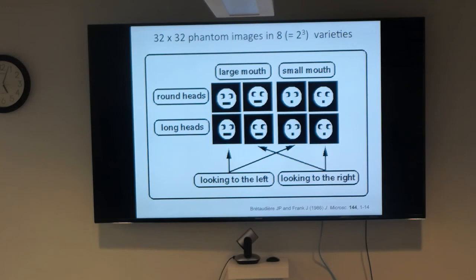I didn't know that projection matching was done in Fourier space. Which package is doing that? Well, in your first slide, when you're using the common lines, I guess you convert everything. You take the Fourier transform first before you compare the projection to the cross section of the structure, I guess. Well, what I've shown there initially are really the concepts, and it doesn't mean that it's done this way. So, for instance, the projection matching is normally done in real space. Okay.